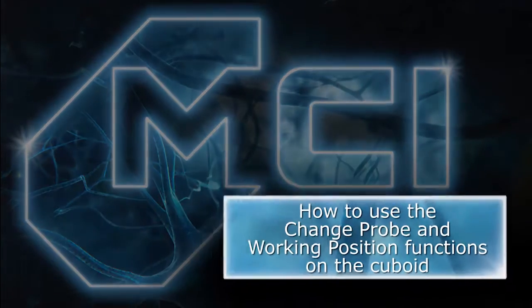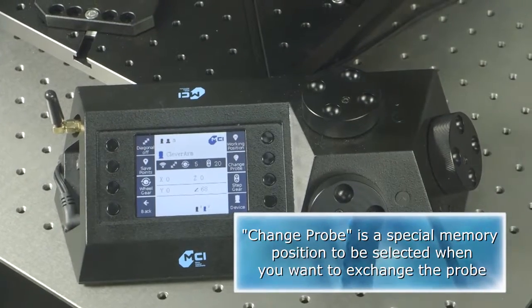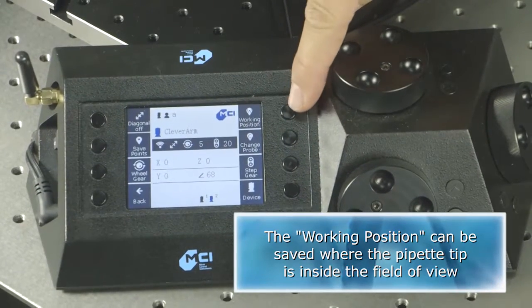How to use the change probe and working position functions on the cuboid. Change probe is the special memory position to be selected when you want to exchange the probe. The working position can be saved where the pipette tip is inside the field of view.